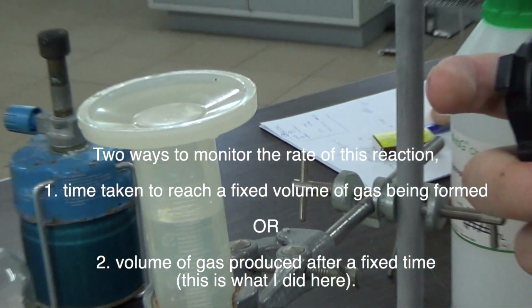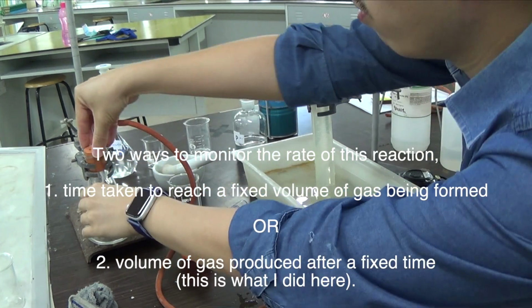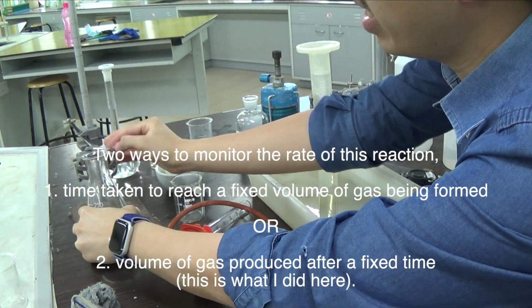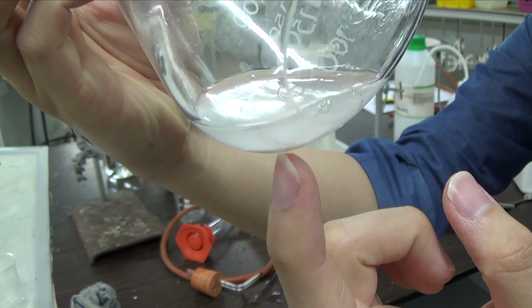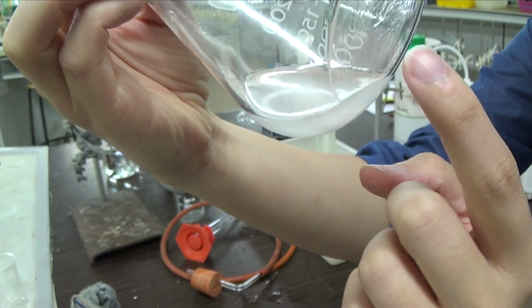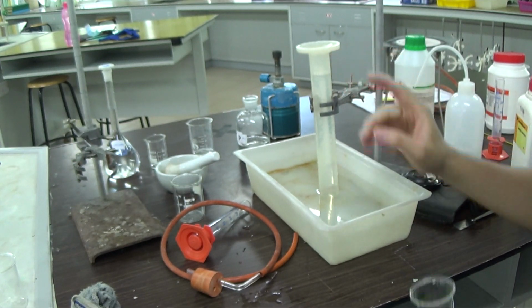All right. So I'm going to restart this experiment now, but with the crushed powder. So I'm going to remove that. Our reaction is not complete yet. How do I know the reaction is not complete yet? As you could see, there is still bubbling, there is still fizziness. The gas is still being produced because you see bubbles, you see effervescence. It's just very slow, and I only record the volume of gas after a fixed time. So I remove that.